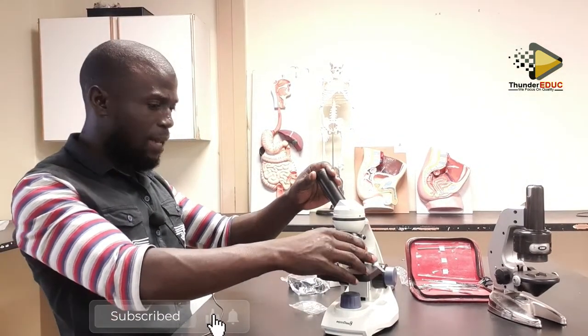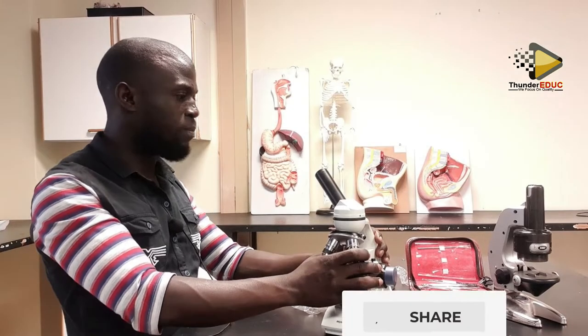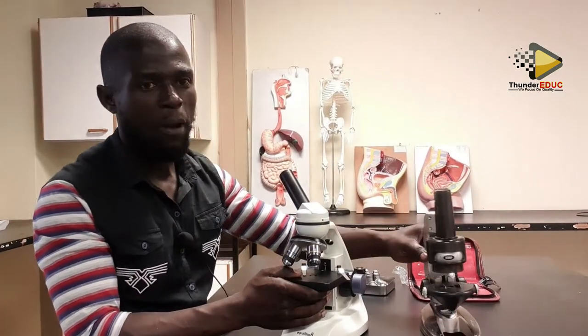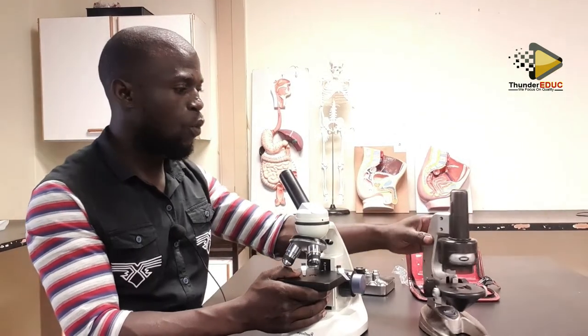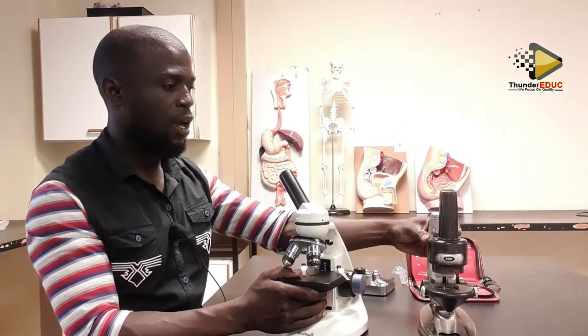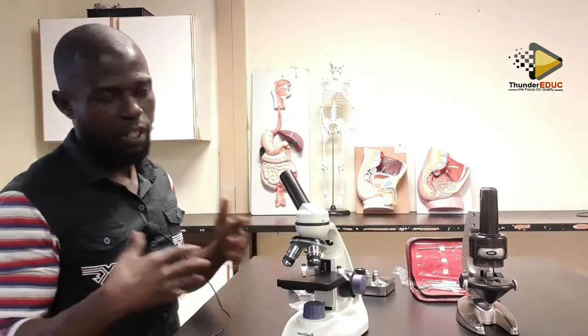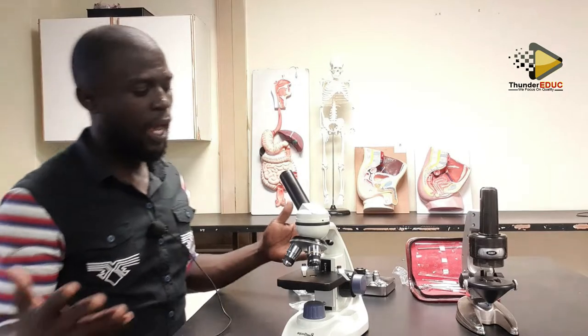What are some of the parts of this microscope? I have two kinds of microscopes here. I have this microscope and I have this microscope. The two work in the same way, but you're going to see how they differ depending on which one you have, which one is used at school, and which one is used at the university. The way it works is the same thing.